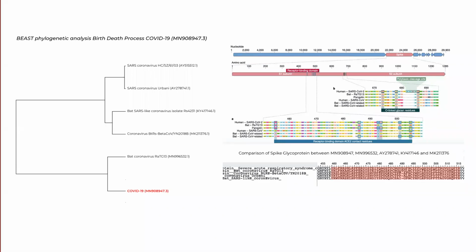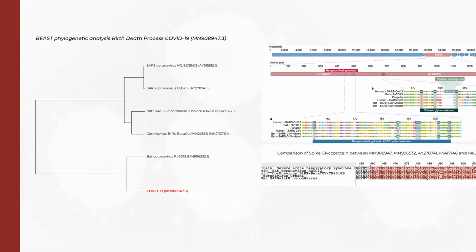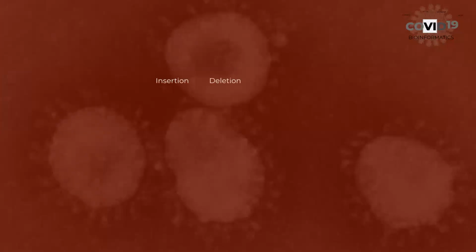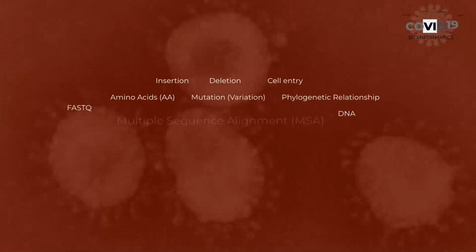The challenge that we'll turn to next is the identification of specific ways these genomes are different by looking at the spike glycoprotein structural subunits that have specific patterns that are important for its function, as well as the adaptation between animal and human hosts. For us to start answering this question, we have to understand the data and how to find meaningful biologically interpretable data, as well as the details in the sequences.